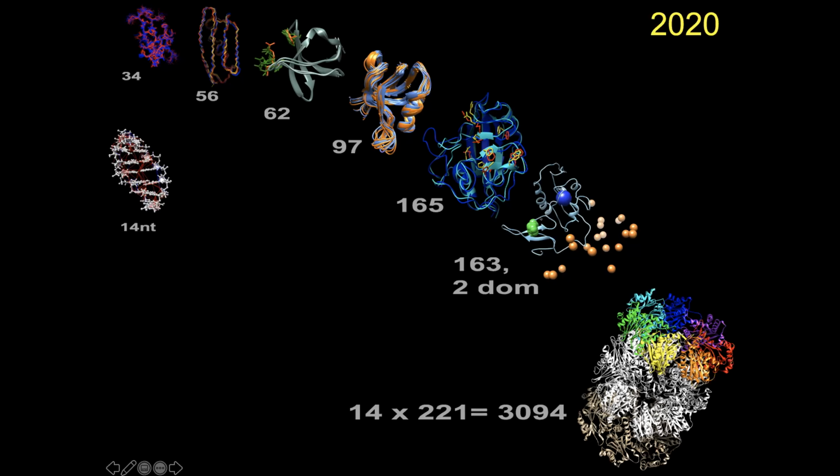You can also apply the method to much larger systems. However, you will not be able to calculate a structure, but you can look at very specific aspects. Here we measured distances only between methyl groups for a proteasome, which is 360 kilodalton in size. So this is huge. And it's probably one of the few methods that still work with such large proteins, maybe apart from just simple chemical shift assignment.